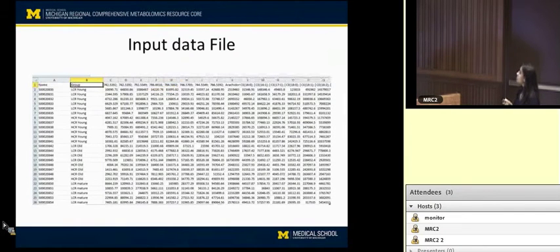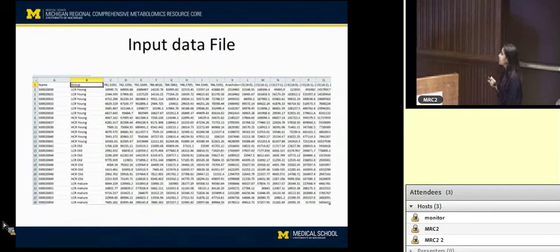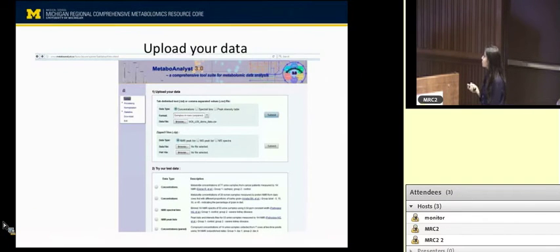With this, the slight modification that I mentioned is that you need to arrange this into one group factor, and that's what I did: LCR young or HCR young, and then define these groups like this. So this is how your data file looks, and I have already put all the data sets that we are going to use for the demo. You can check those files, and they're in the right order, the way you need to put it in the MetaboAnalyst.